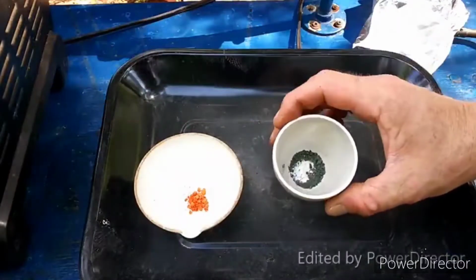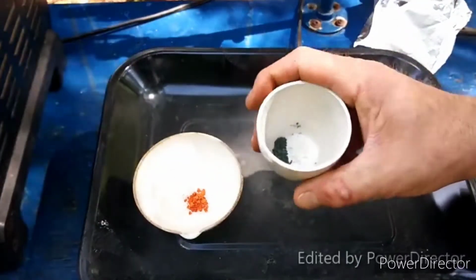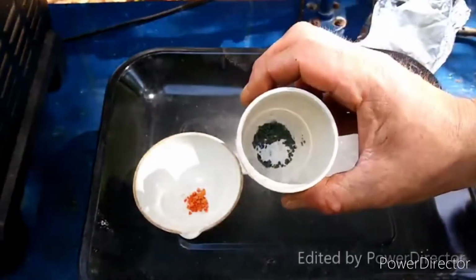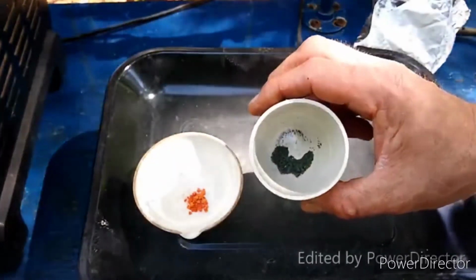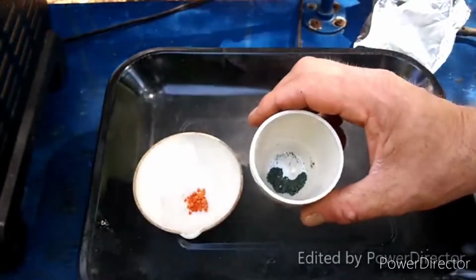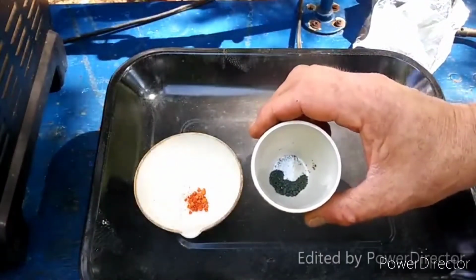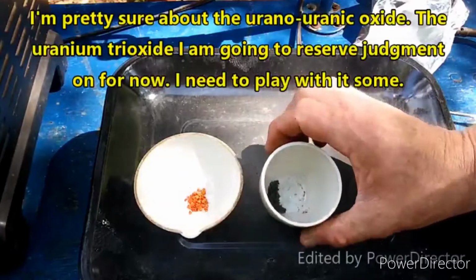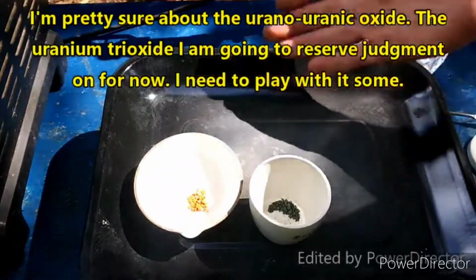Now, this is our green oxide of uranium, the Urano-Uranic Oxide, and as you can see, that worked marvelously. That was beautiful. It's not completely pure. Again, this one also looks like it could use some more time being calcined, but once again, here even much more so, we're on the right track, and this is the viable way of producing these things. So I am going to go ahead and end the video there with two apparent successes.